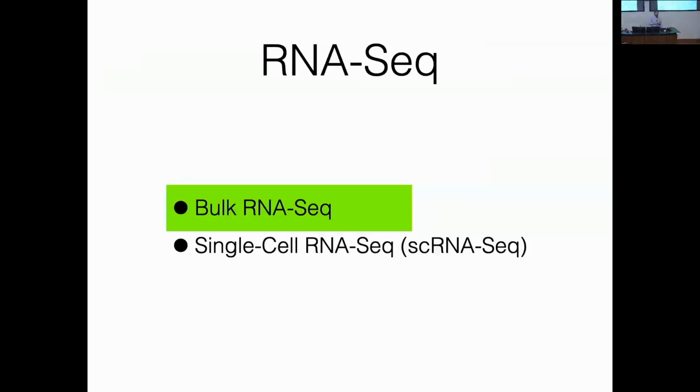There is a technology, single-cell RNA-seq, or a collection of technologies, that we'll be getting to in 2 weeks, I think. 2 weeks from today, we'll start talking about single-cell RNA-seq, and I'll give the first lecture of that. Then we'll have someone, Tyler Shapey, doing 2 more lectures after that on the hands-on analysis. In single-cell RNA-seq, instead of getting an average, you actually get per cell expression levels.